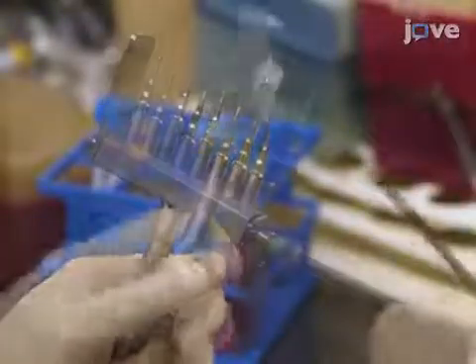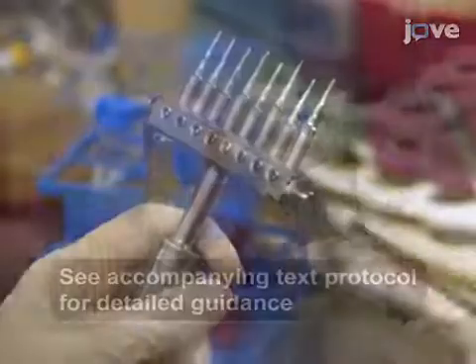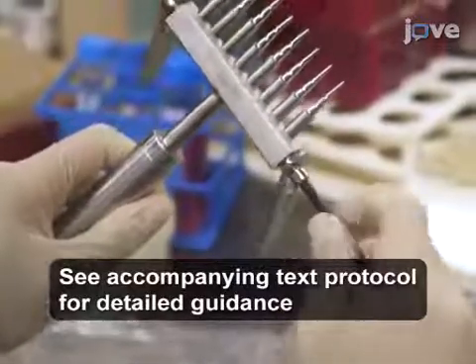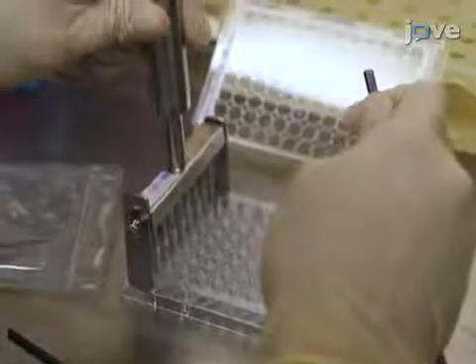Use an M5 hex wrench to loosen the hex socket headcaps. Insert a suitable number of adjusting rings to both sides of the pin holder so that the guiding bars fit perfectly with the width of the 96-well culture plate. Then tighten the hex socket headcaps.